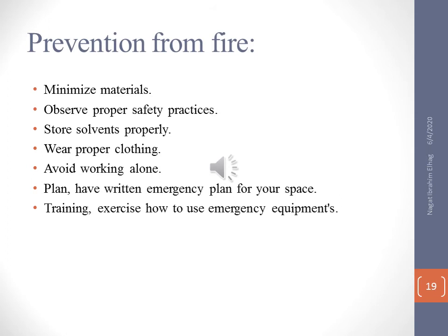They must be discarded out of the laboratory immediately. Also, observe proper safety practices, observe how the machine is working, and check for any problems with the electricity, the water supply, the filter system, anything that you have to observe from time to time to avoid any fire in your lab.